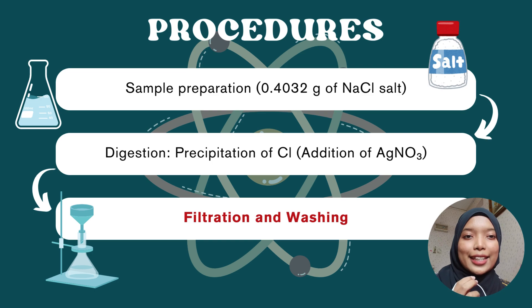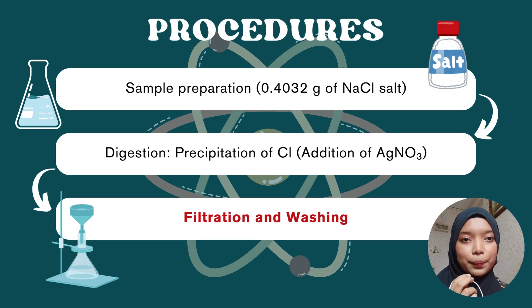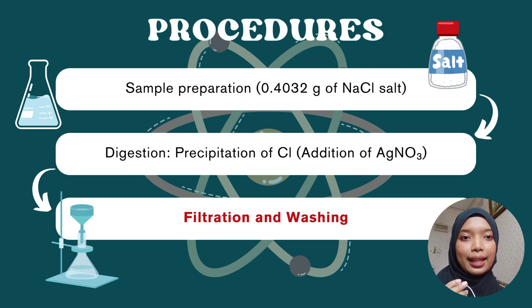After that, the AgCl precipitate is filtered using filter paper and rinsed with HNO3, nitric acid, several times until the filtrate is free from silver ions. To determine if the precipitate is free from silver ions, a small amount of the excess solution is tested. If there is no turbidity observed, then the precipitate is silver ion free.